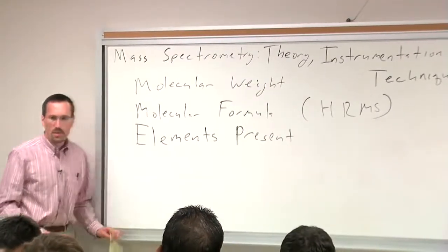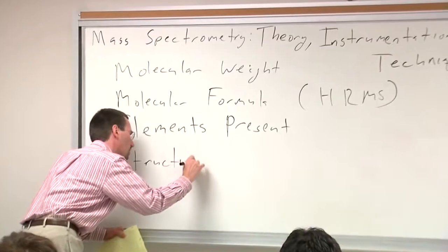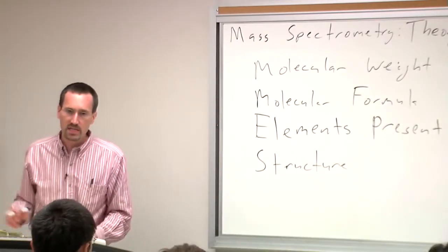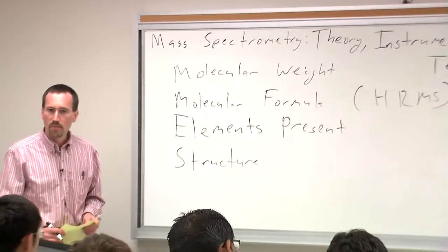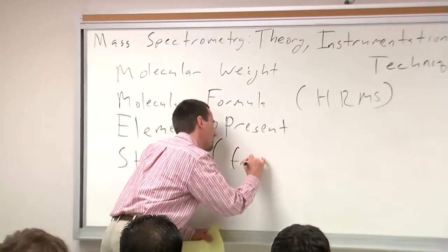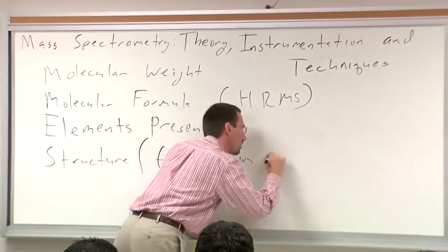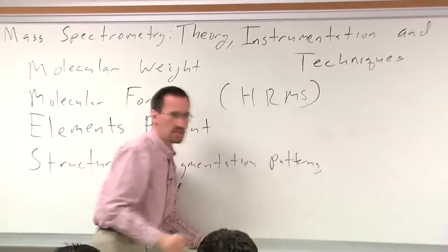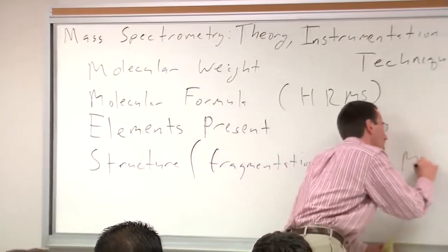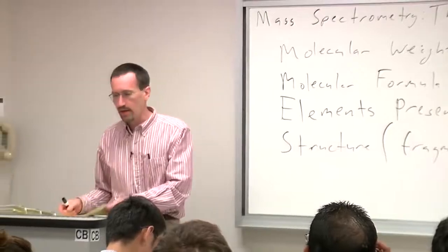And these days, mass spec can also be incredibly valuable in getting structure. It's in fact become central to biomolecular mass spectrometry, to sequencing peptides and proteins, but also for more traditional organic structures and natural products. You can get structure through fragmentation patterns, which, as I said, we'll be talking about a little bit on our third lecture. And as I said, in biomolecular cases, through techniques like MSMS, where you're actually taking ions and deliberately bashing into them and smashing them and seeing how they break up.